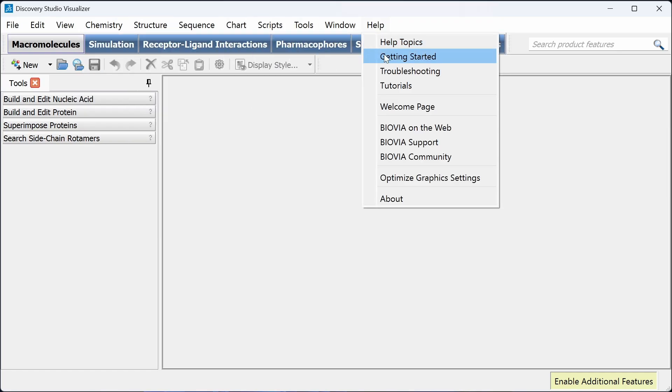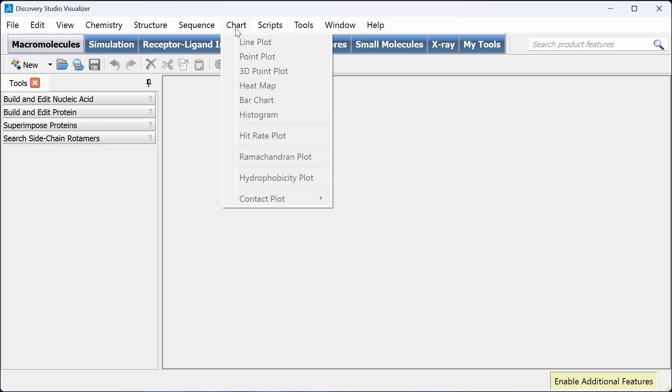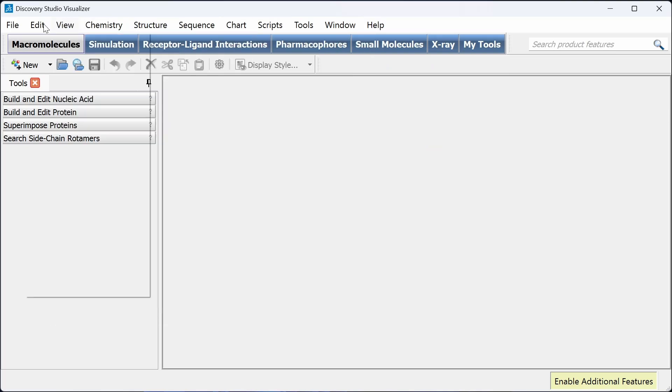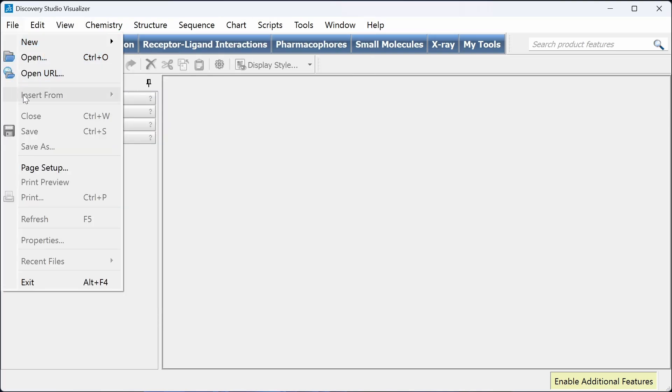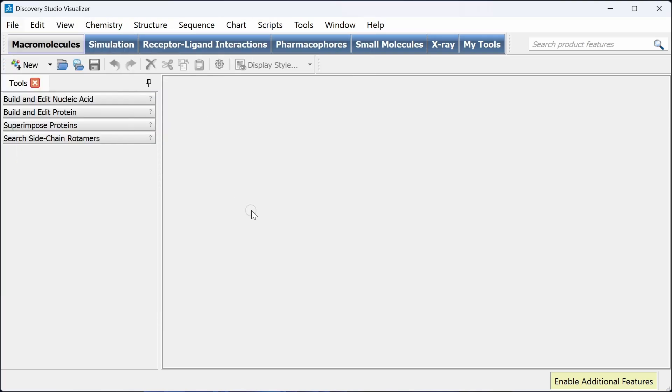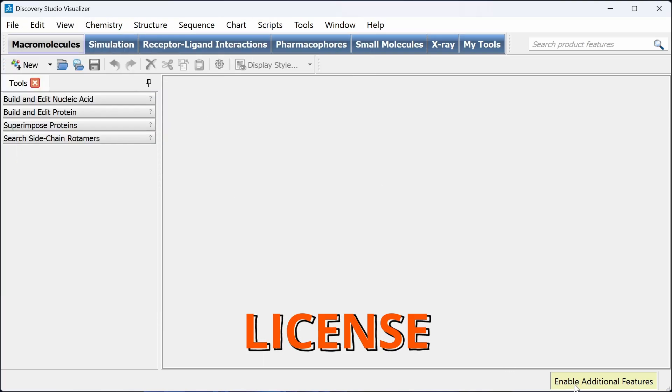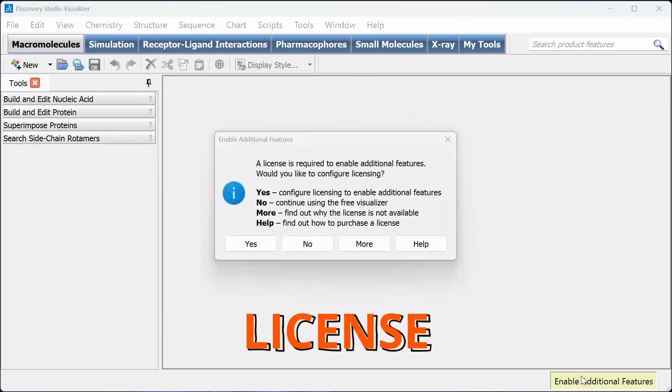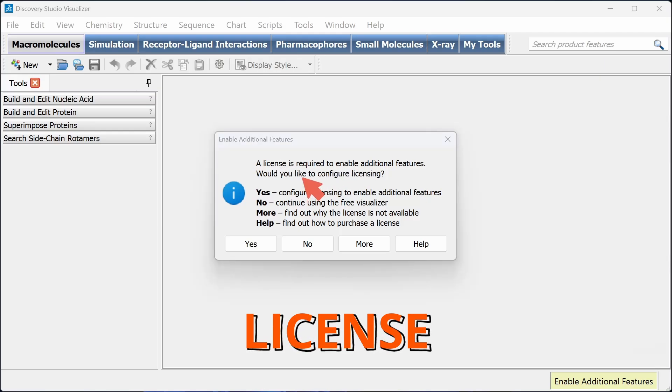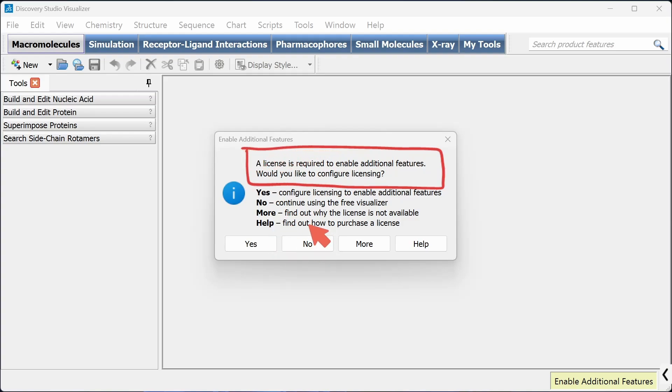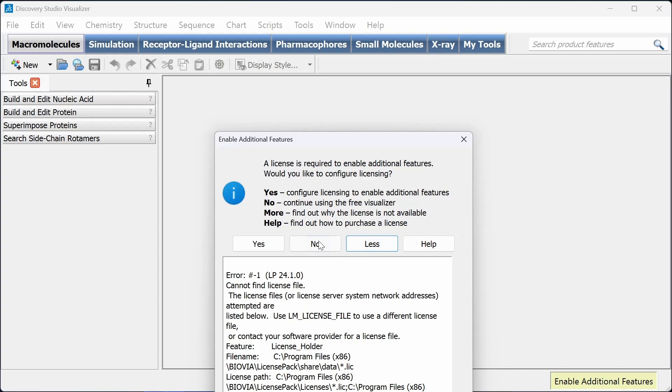Here you will have various options. In the bottom right corner, you can see there is additional features. If you have a license for Discovery Studio Visualizer, you can add your license here so that you can enable the additional features also.